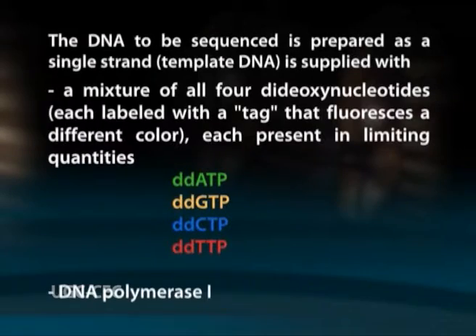Because all 4 normal nucleotides are present, chain elongation proceeds normally until by chance DNA polymerase inserts a dideoxynucleotide, shown as colored letters instead of the normal deoxynucleotide shown as vertical lines. If the ratio of normal nucleotide to the dideoxy versions is high enough, some DNA strands will succeed in adding several hundred nucleotides before insertion of the dideoxy version halts the process.